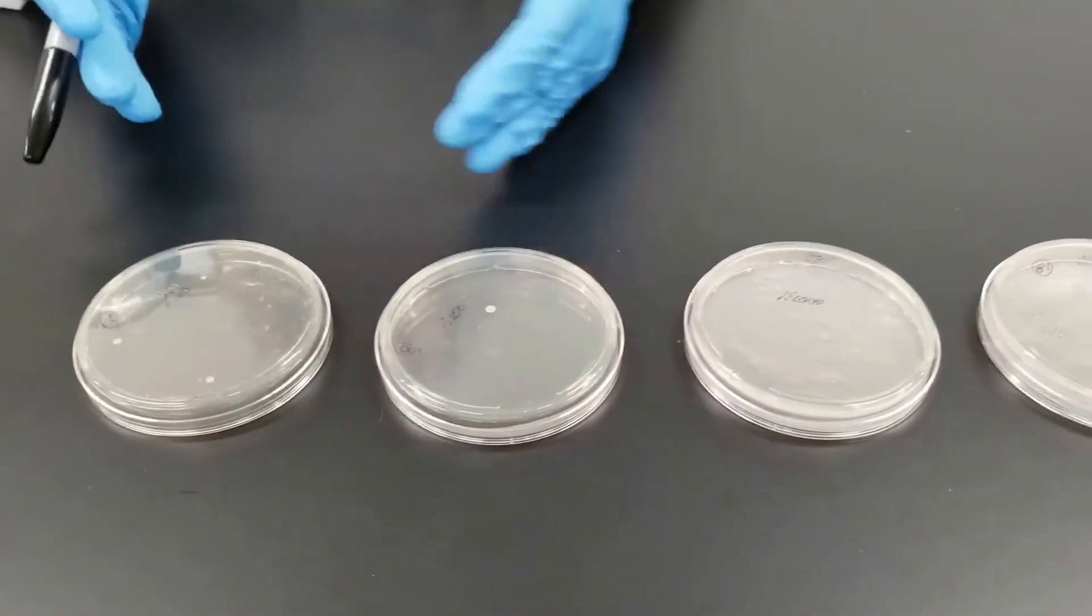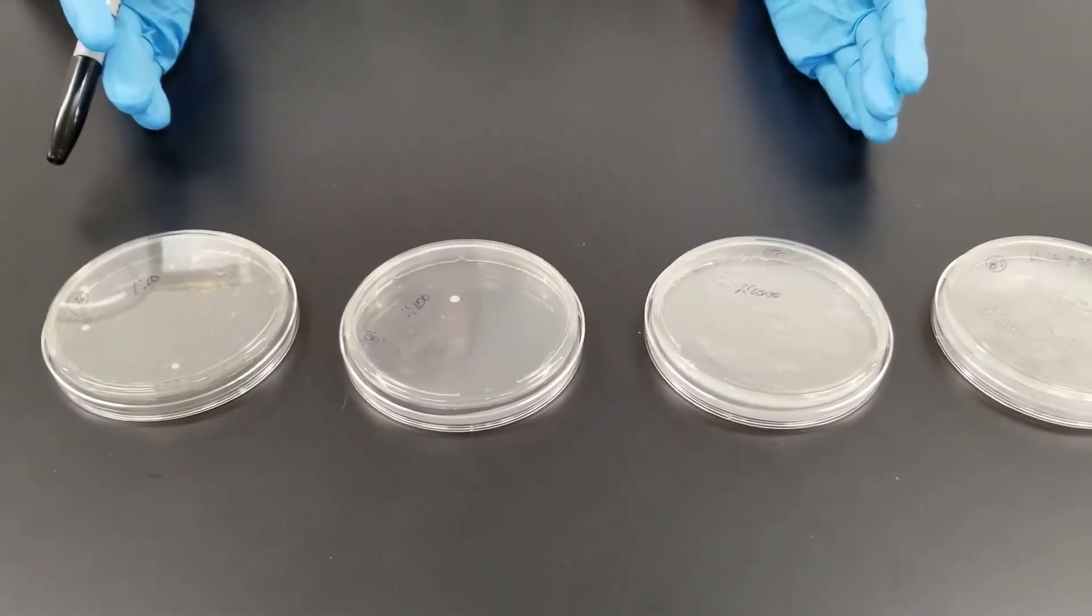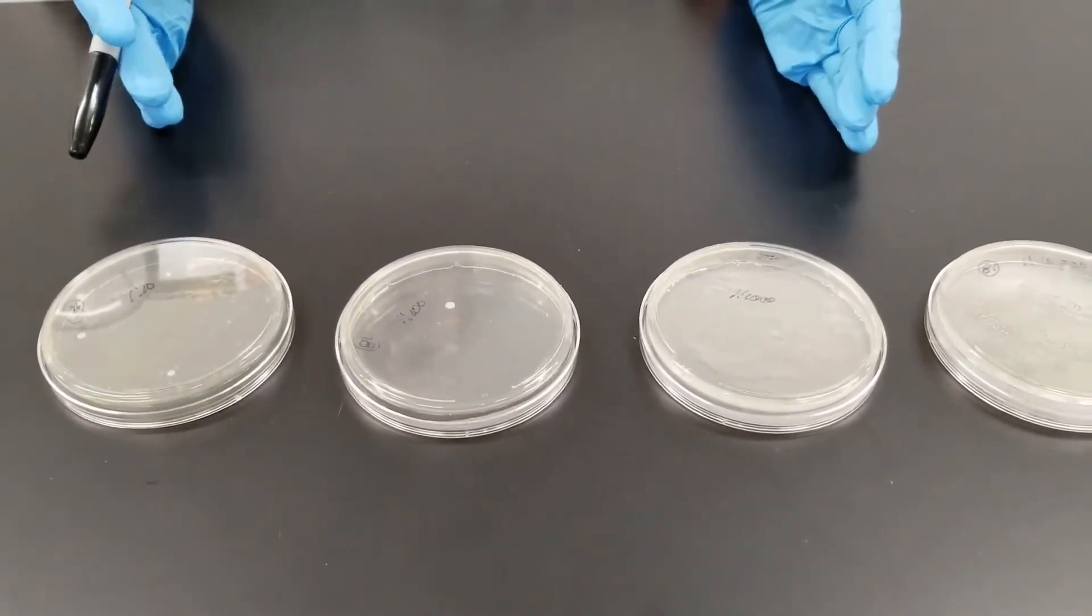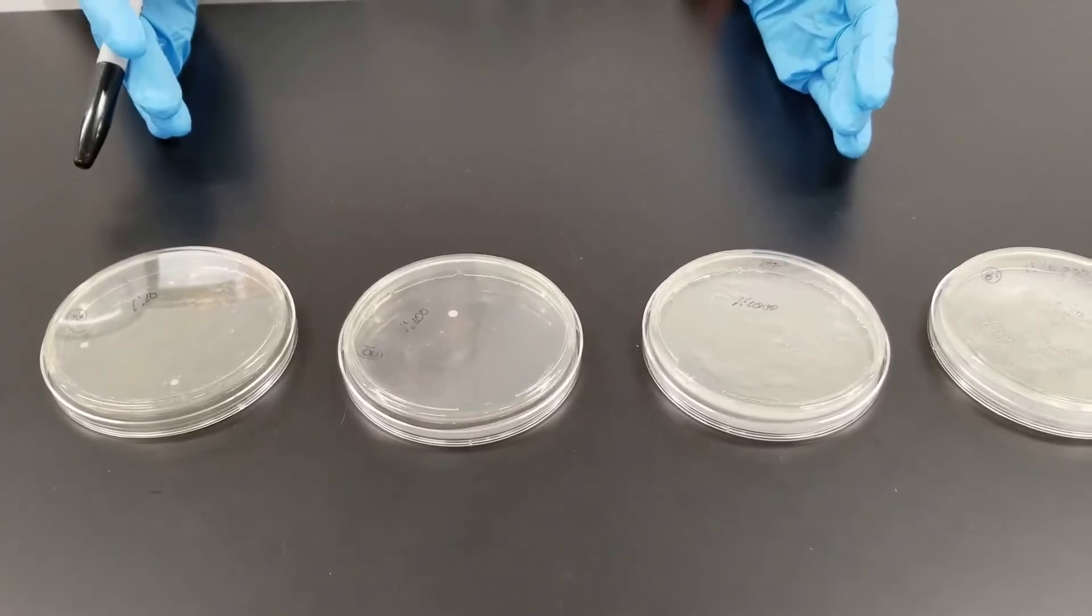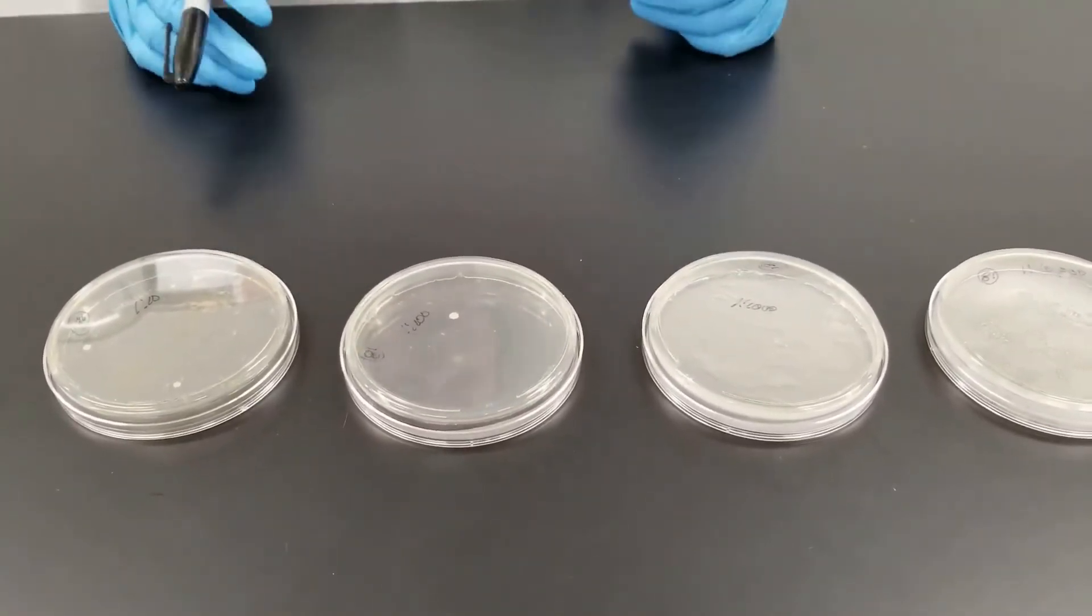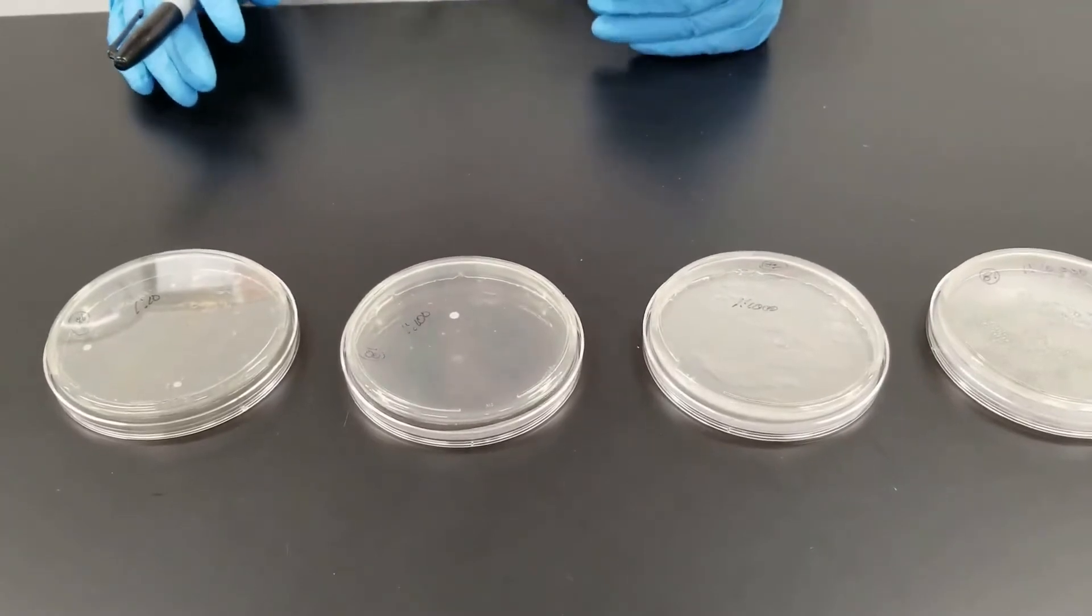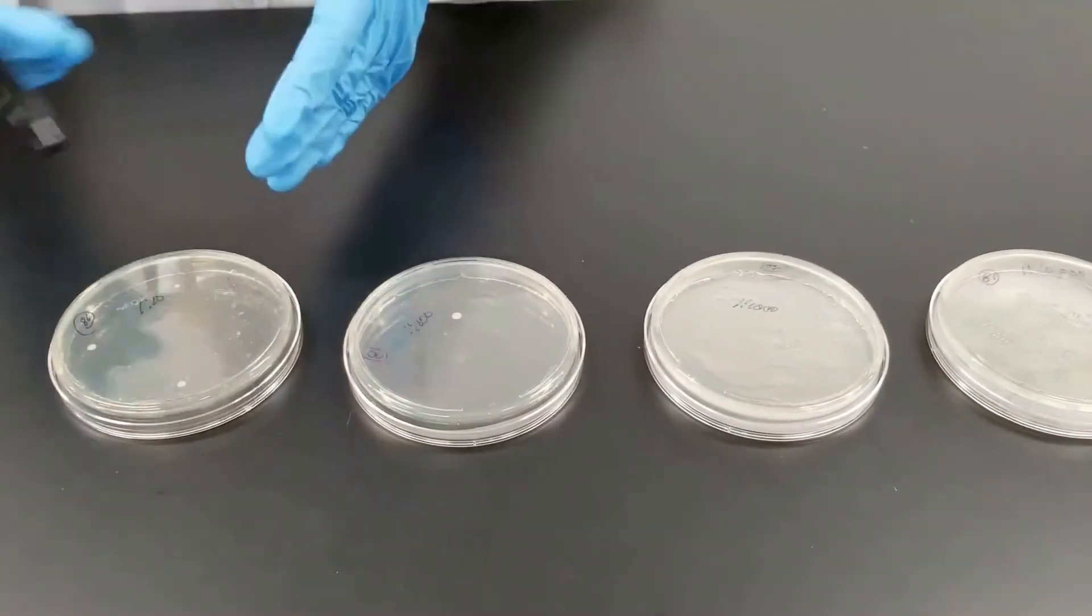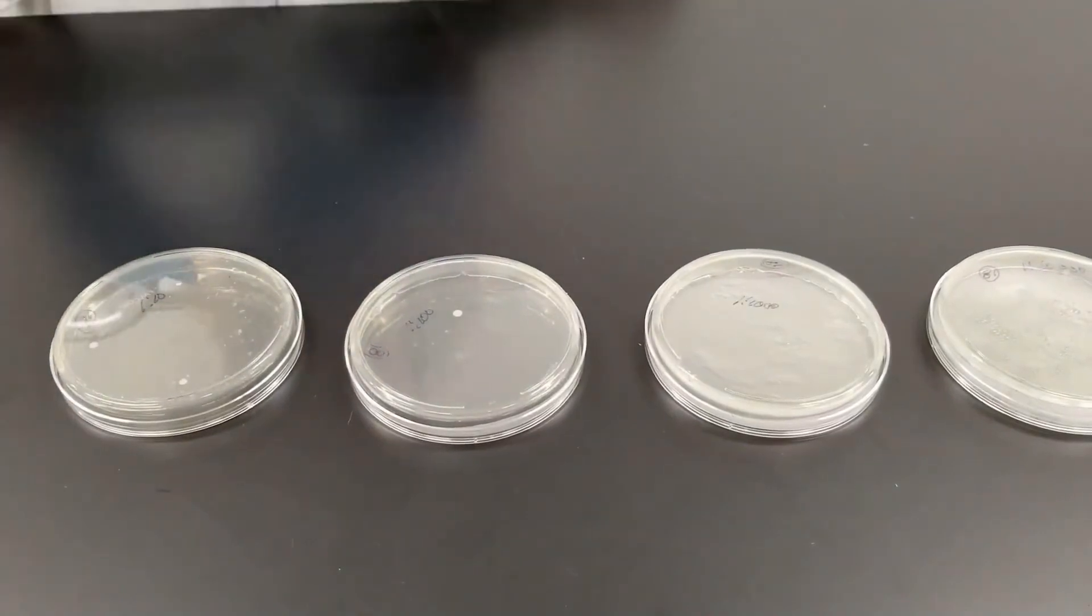So we're trying to hit a range where, when we count colonies, we only count between 30 and 300. So we're trying to hit within that range when we did the plate counts. These are pour plates, so we've mixed in the solution, the medium, and then poured the agar on.